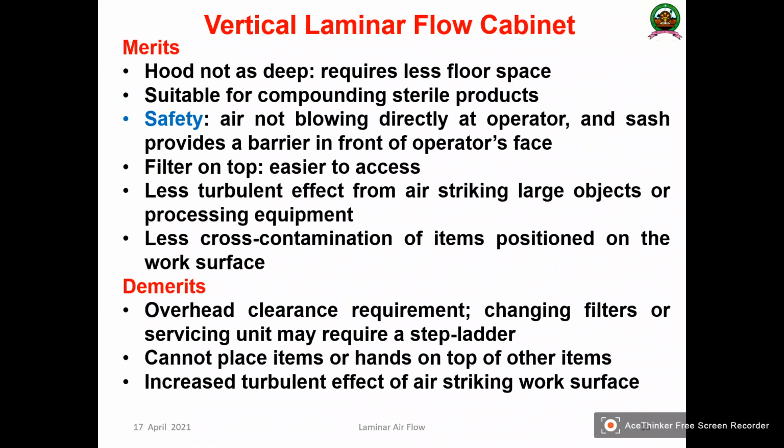And the major merits of vertical laminar airflow are: the hood is not as deep, it requires less floor space, suitable for compounding sterile products, the safety, air not blowing directly at the operator, and the sash provides a barrier in front of the operator's face.